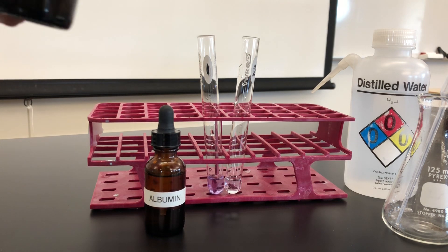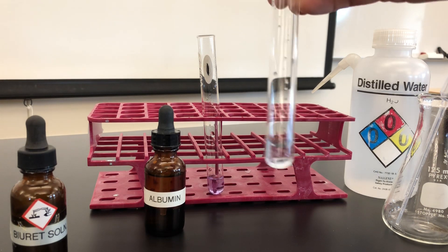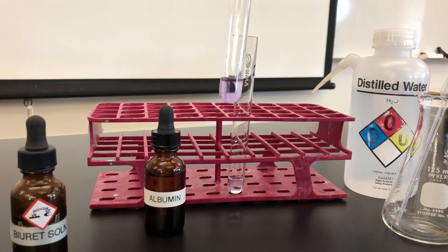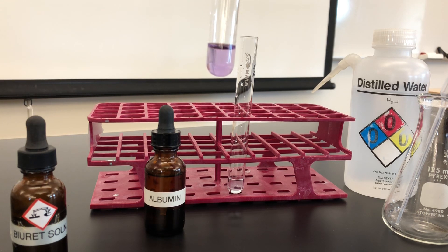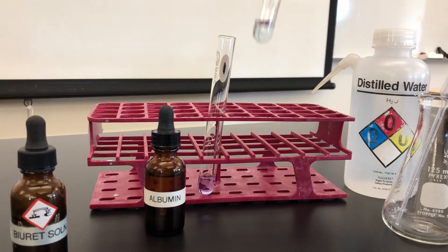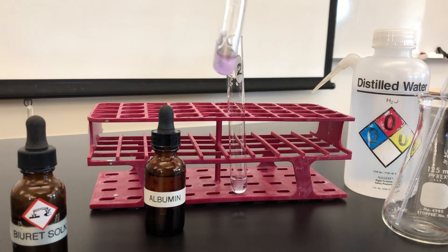Biuret by itself has a very pale, ever so slightly blue color — I'm not sure if you can see that. That was test tube two, but look at the color of test tube one. A positive result turns into a lilac purple violet color, and that tells you that protein is present. So no color change, or staying with the pale blue, means negative, and violet or lavender means protein is present.